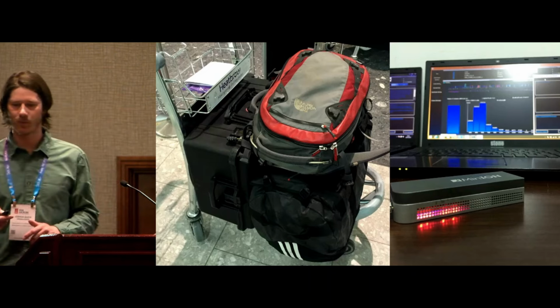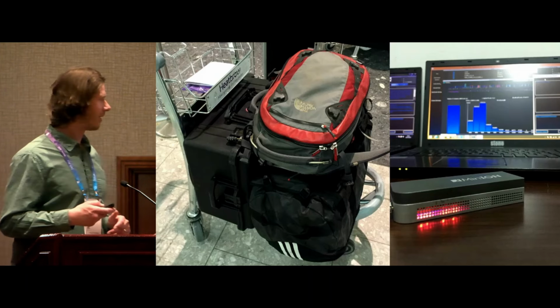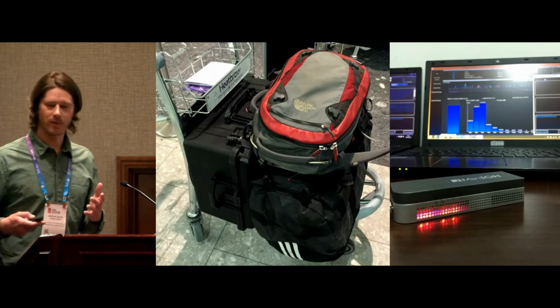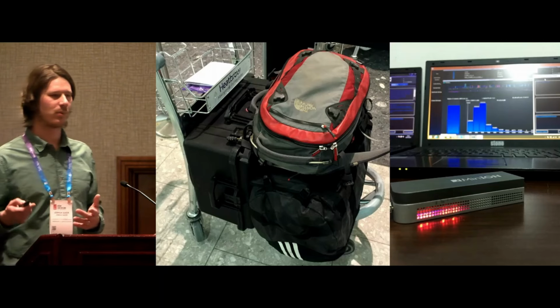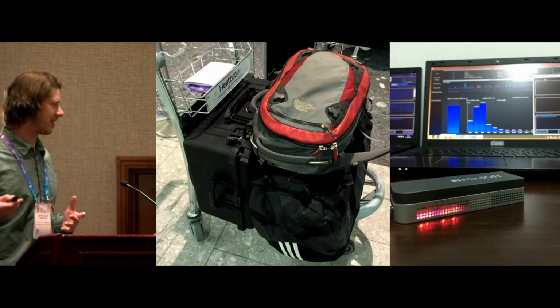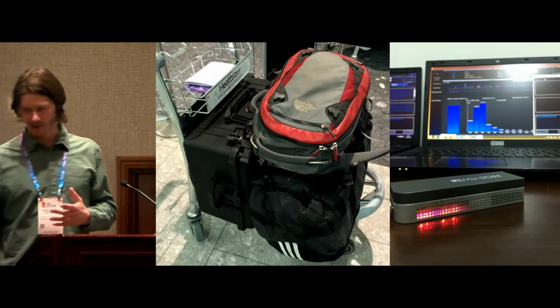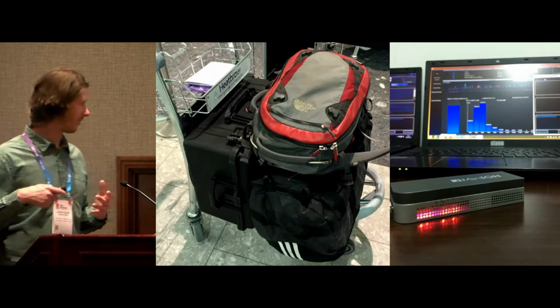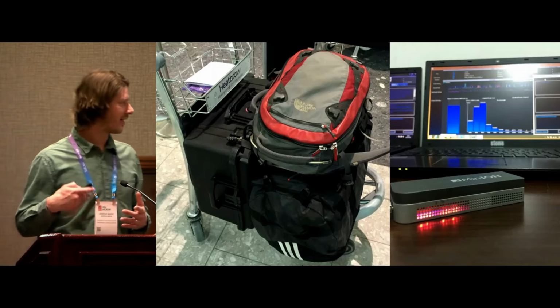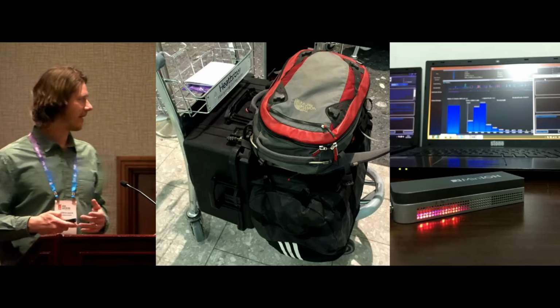So rewind back to early 2015. I think this was April 2015. We'd been wanting to use the MinION to sequence Ebola samples in West Africa. Obviously it was quite difficult to transport samples out of West Africa, so we wanted to put together a mobile lab with the MinION and go to West Africa and do the sequencing there. So that's what I did.